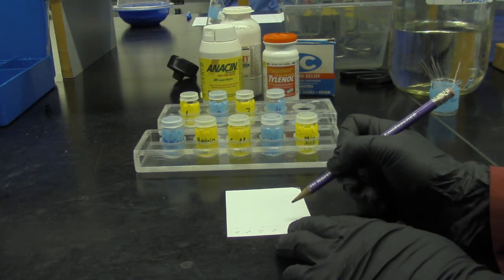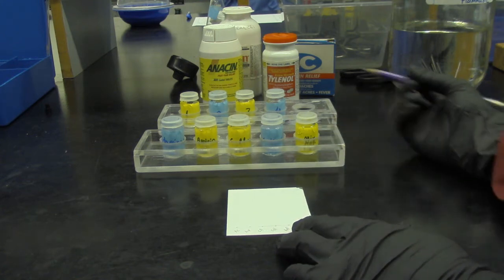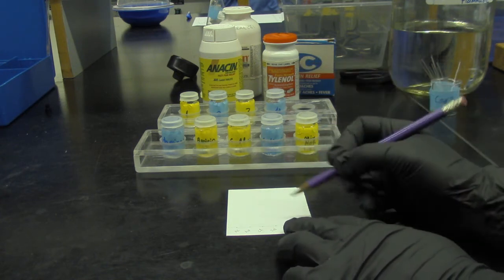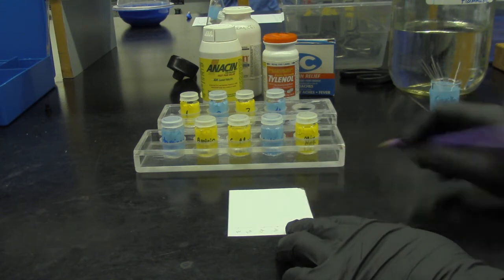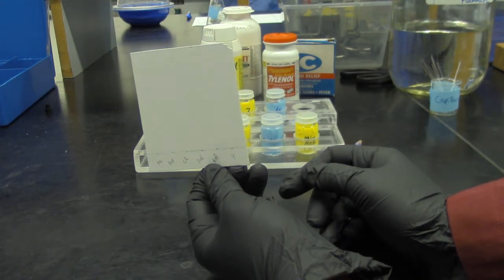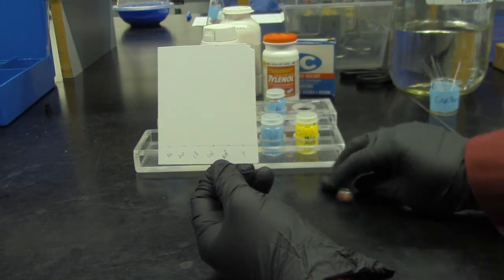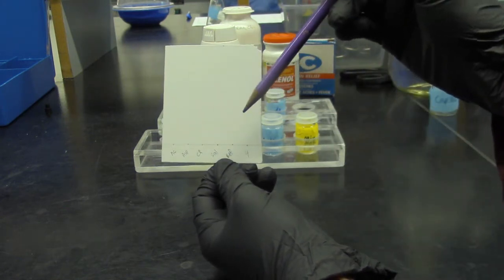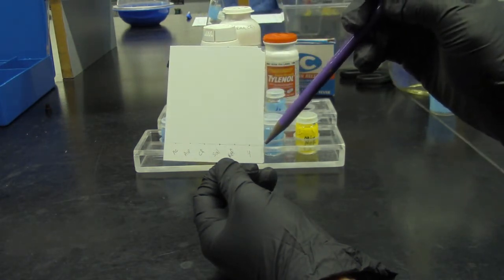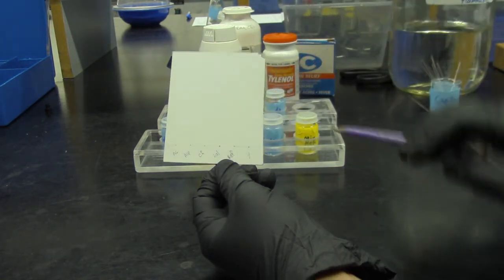The fifth one is the reference mixture, so REF. And I'm going to pick one of the unknowns as well, so let's say unknown number 4, so I put 4. This is how I pre-label the plates before I spot them, so I know exactly where I'm spotting and that I'm not overlapping the spots, and I have to make sure that everything is starting at the base equally at the line drawn across here.